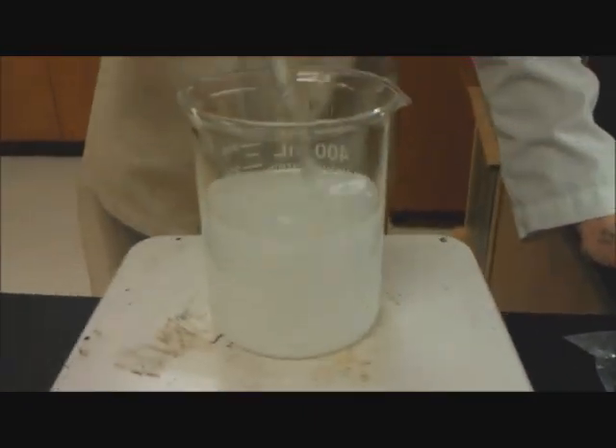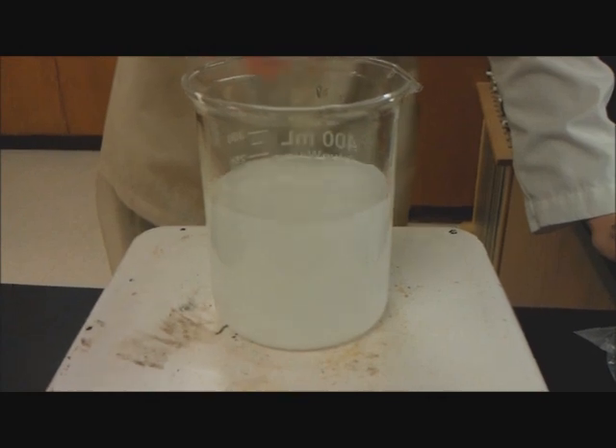We're waiting for this to heat up and dissolve. Once it's nice and clear and near boiling, that's the right point.